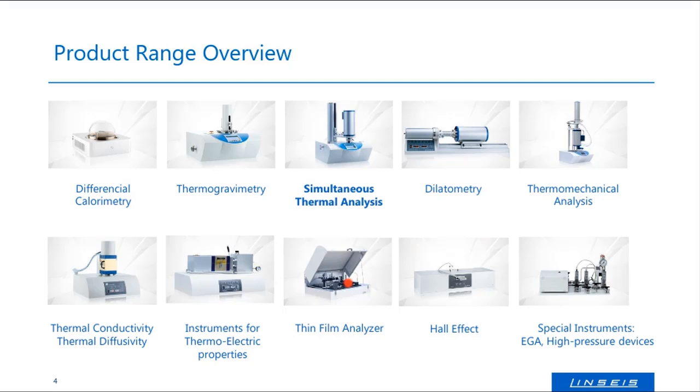And we are also investigating them regarding their temperature stability and their behavior at different temperatures. And the most recent instrument is the Hall effect, belonging to the thermoelectrics. And as I said, a lot of thin film analysis. Besides that, we are doing special instruments, that means high pressure and high temperature devices. All what you can see here can be equipped with high temperature or ultra low temperature furnaces.